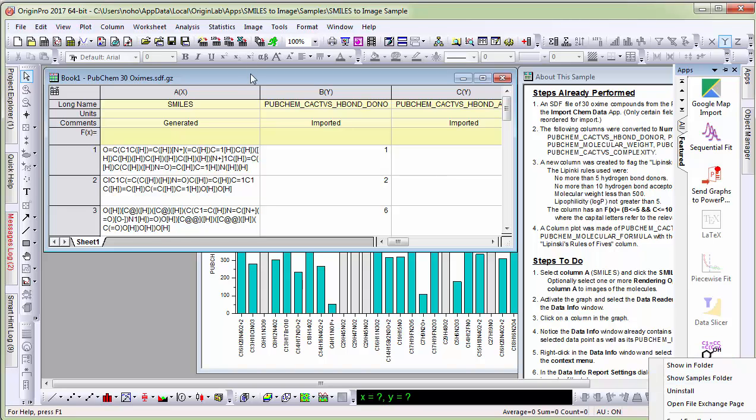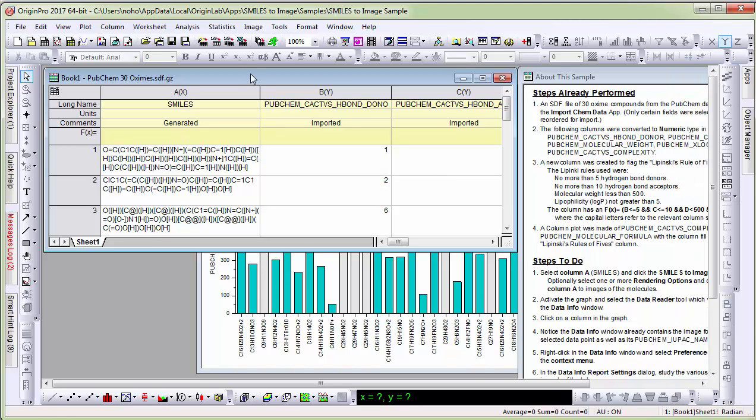In this project I have a worksheet with several columns of data that were imported from an SDF file from PubChem.